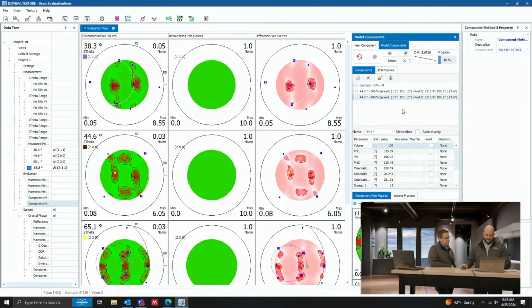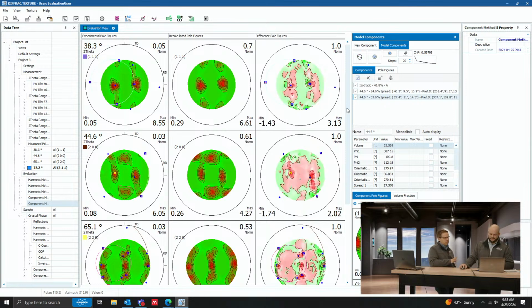Oop, did I accidentally add 2? I might have. Get a little click happy. You got a little ambitious there. Yeah, that's right. So let's see. We'll let it finish, and then I can readjust. And so right now, actually, I think it's just refining the 1 component, right? Because I'm guessing you pressed that. Yeah. But we'll want to refine it now with both of them refining. Yep. Oh, no, so there is both in there. Oh, okay. All right, that actually looks pretty good.